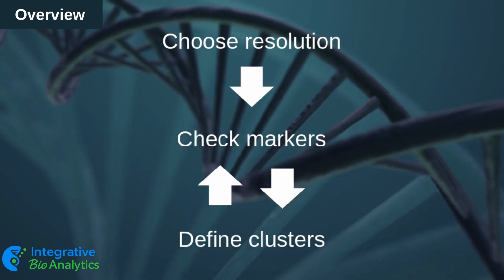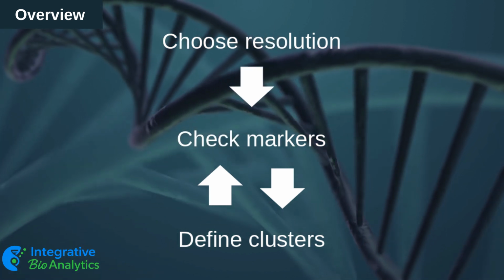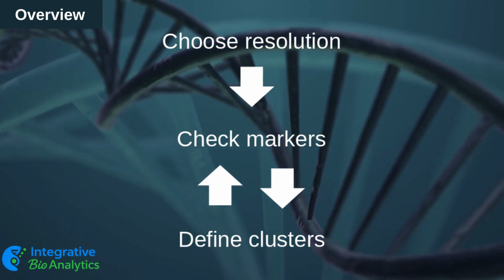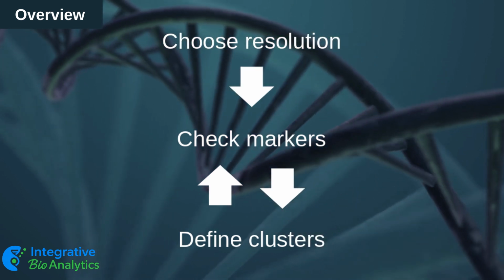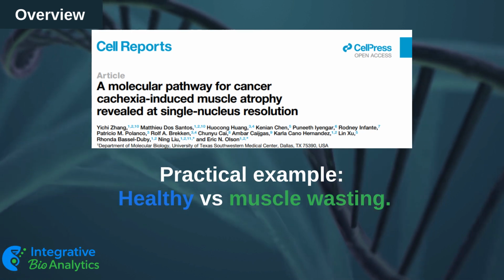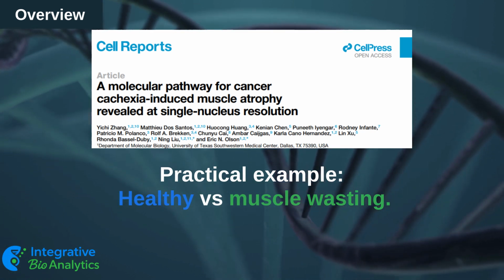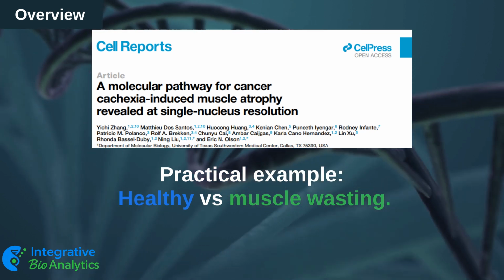There are many ways to explore the data, but the steps are simple. Pick a resolution that shows the cell diversity you need. Then check the gene markers and decide which clusters to merge, rename, or throw away. To make it easier, we will walk you through the process with a real example. Muscle samples from healthy mice and a model of muscle wasting.